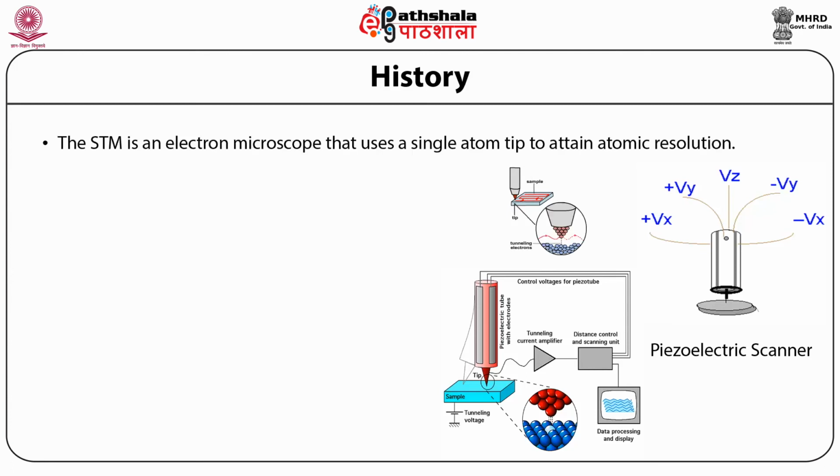STM is an electron microscope that uses a single atom tip to attain atomic resolution. It consists of a piezoelectric scanner.